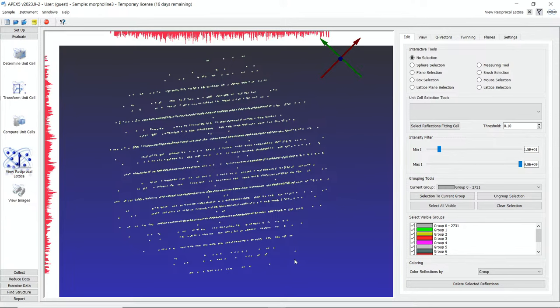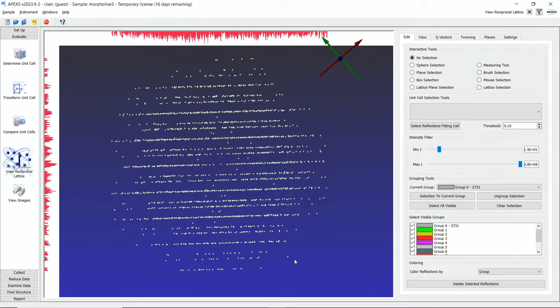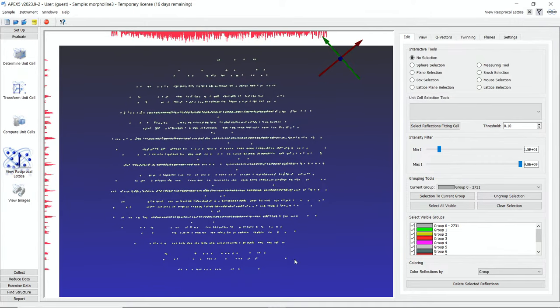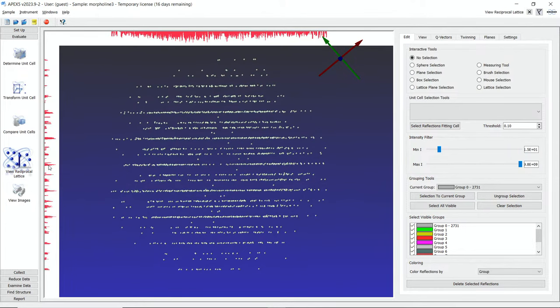With a bit of experience, it's pretty clear that this is not a regular structure. I will rotate this so that I can look at the histogram over here. You can see that these lines that are a little denser are also stronger. Let's make that a little clearer. It looks very similar to your illustration from before, but now we're looking in 3D. So it adds that layer to it. Exactly. So you see now strong, super weak, weak, weak, super weak, strong. We have this pattern. We see actually that there's some sort of modulation running over this.